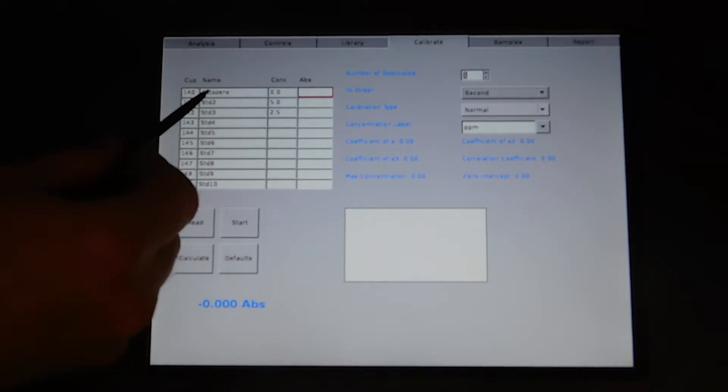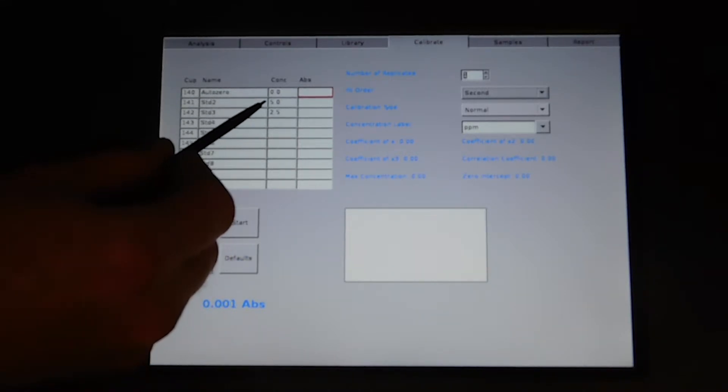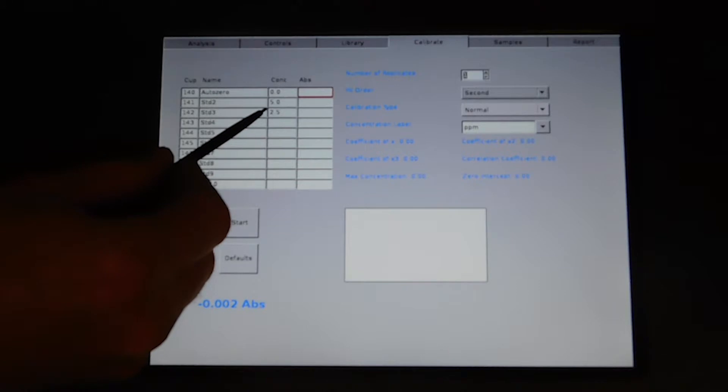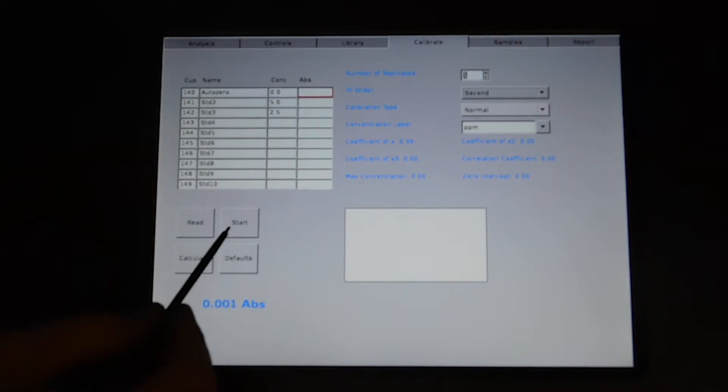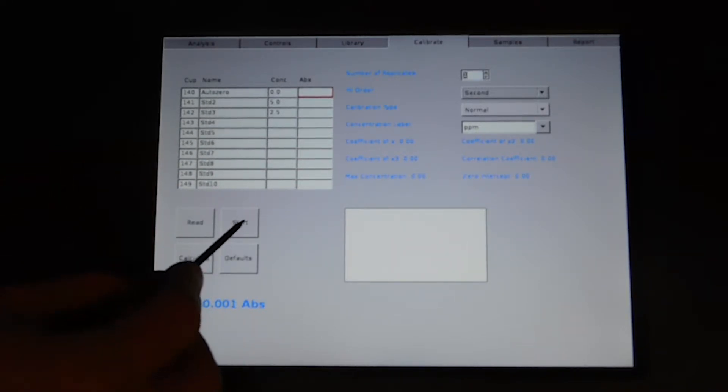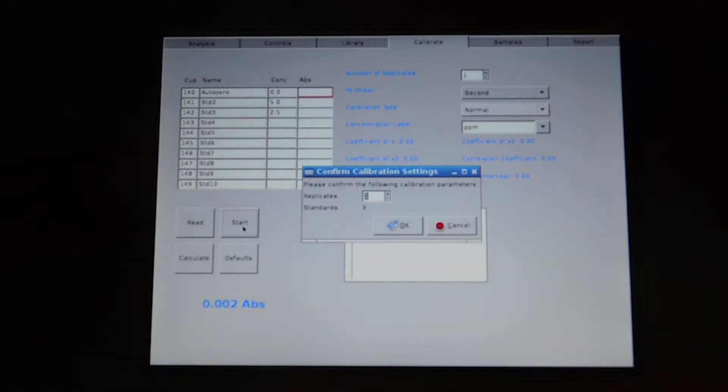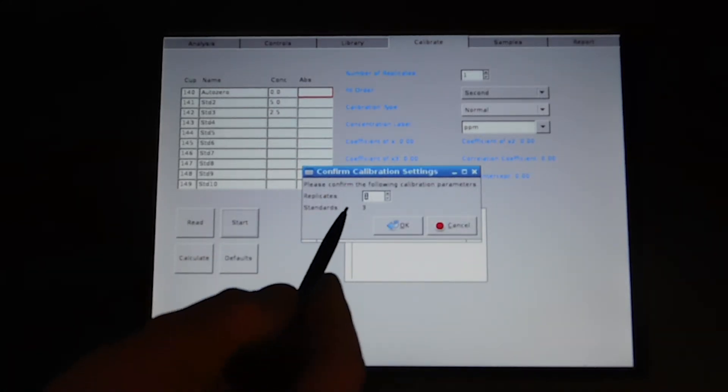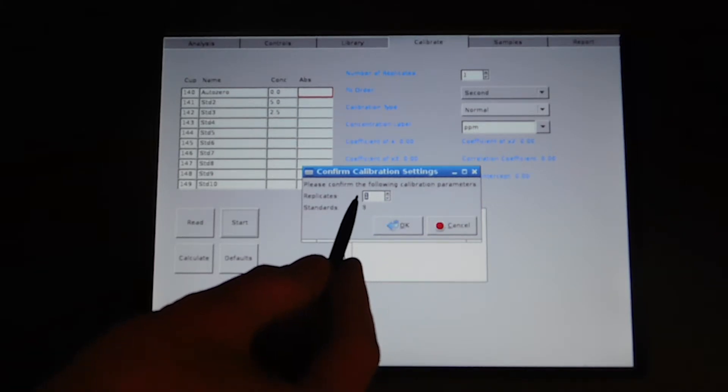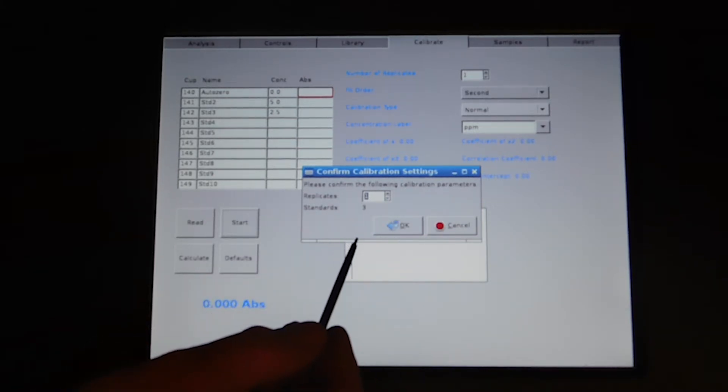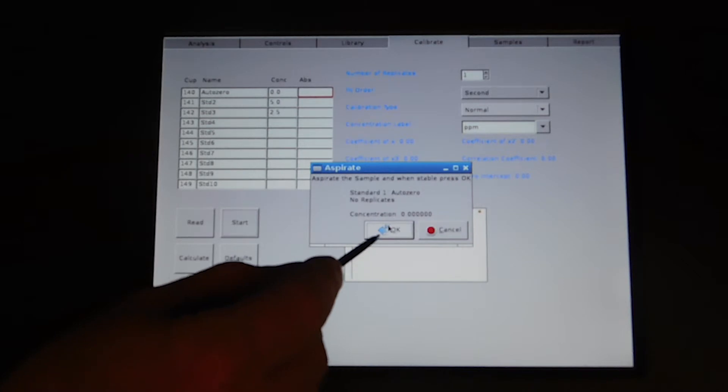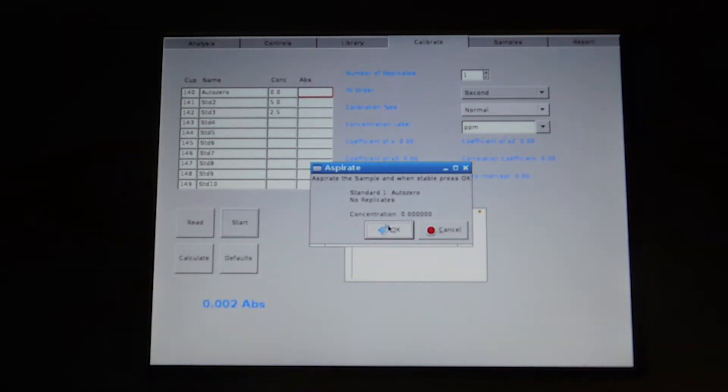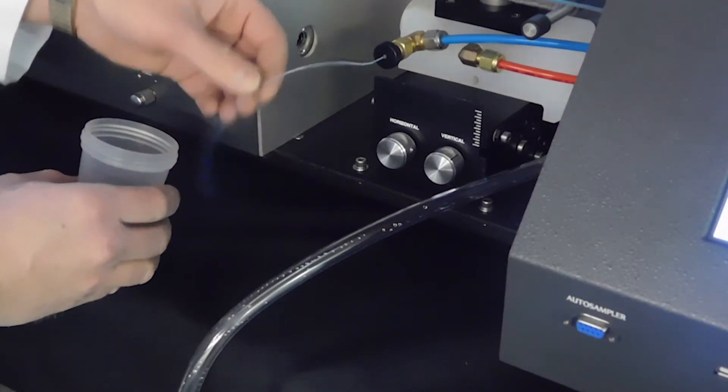First, we're going to be running blank and then we'll be running our high standard and then our low standard. We press the start key to start the procedure. We'll be prompted for which sample we are using first. We're performing each sample only once and we have three standards. We hit okay. We're doing our auto zero first.